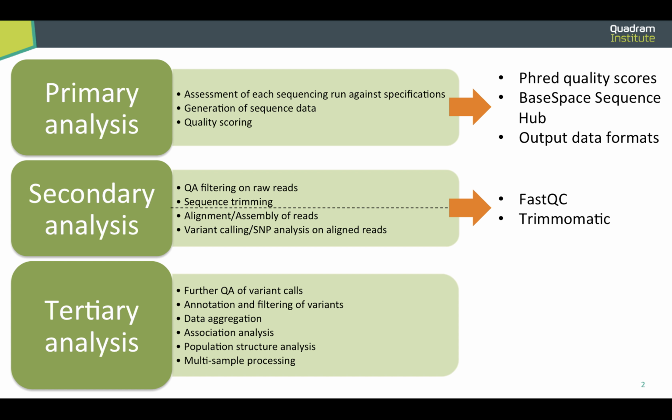If I had a bit more time, I'd then talk about aligning or assembling the reads, so going from little short sequences of a few hundred base pairs into long chains of kilobases of DNA, and also comparing that to perhaps a reference genome that's already been sequenced and identifying differences between that. A lot of this will be spoken about a lot later on. We'll go through the workshops and demonstrations, so you'll actually have a chance to do a lot of this stuff on your own later on.